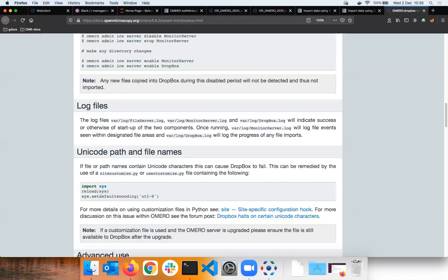It sounds good. For the Dropbox import, you would probably need a collection of cron jobs, as I said, to decide which files to import. A cron job is basically a job that you schedule. You say, okay, I want it to run every day at midnight or whatever, and IT will set that up for you.